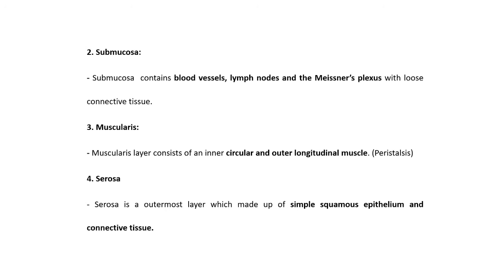So this peristaltic movement, or we can say mechanical digestion, takes place in the small intestine with the help of this special area, that is muscularis, because this area is highly lined with circular and longitudinal muscle.